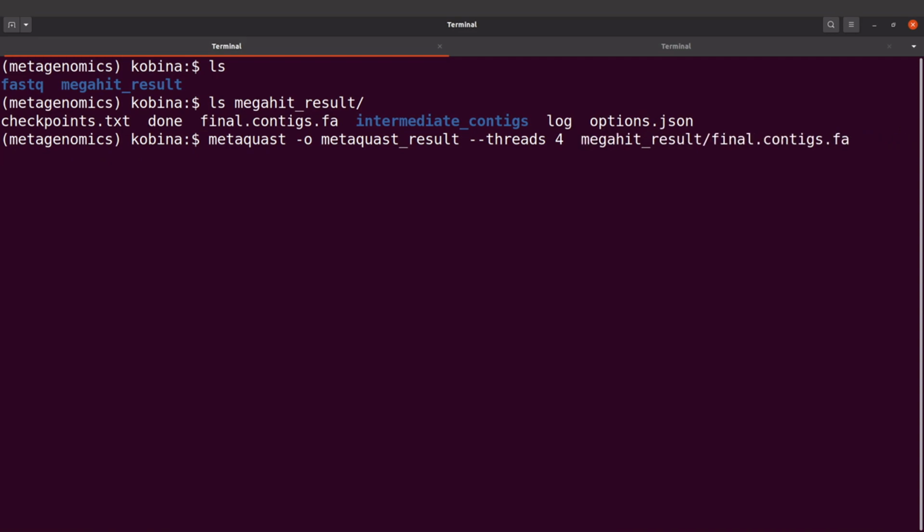So this one is simple and straightforward. So I'm going to start with this, and later, if you have space, you can just add the other flags to include the FASTQ files. So for now, let's execute this command.